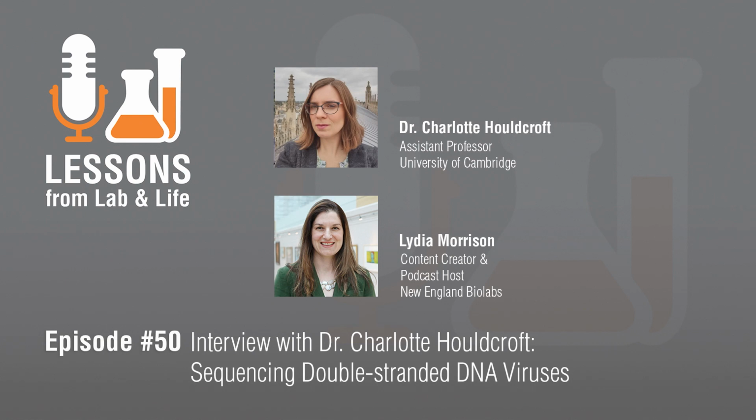But if you know that you have, for example, SARS-CoV-2 viruses that are broadly quite similar to one another across the population, you're inputting lots of the same thing, the virus loads tend to be quite high, and you need your answers in a hurry, that's when the PCR approach is absolutely fantastic. And as you mentioned, there's no reason that you can't say, well, we've started with some PCR-based sequencing, and we think there's more questions that we want to ask, and now we're going to drill down to the samples that are most interesting and use metagenomic or bait-based sequencing. So I certainly see in the future of my laboratory research that I'll be using all of these methods.